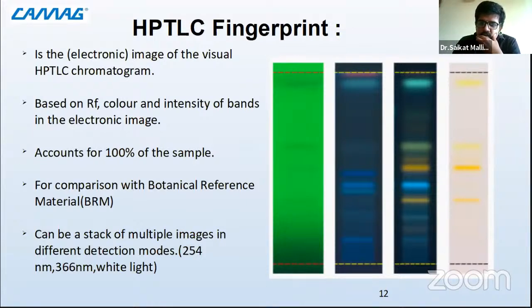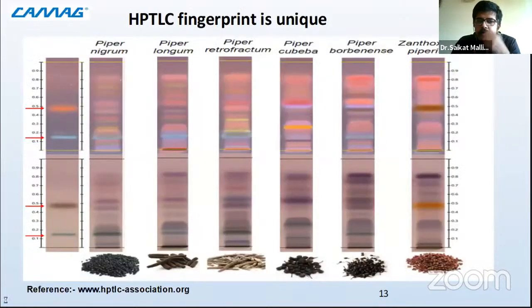So the reflectance which you observed is being traced back with the detector, and from that you can find out the three different activity levels of the molecule in three different wavelengths. So this is an example which depicts exactly the same thing. Now, when we talk about fingerprint, this is the concept of fingerprint.